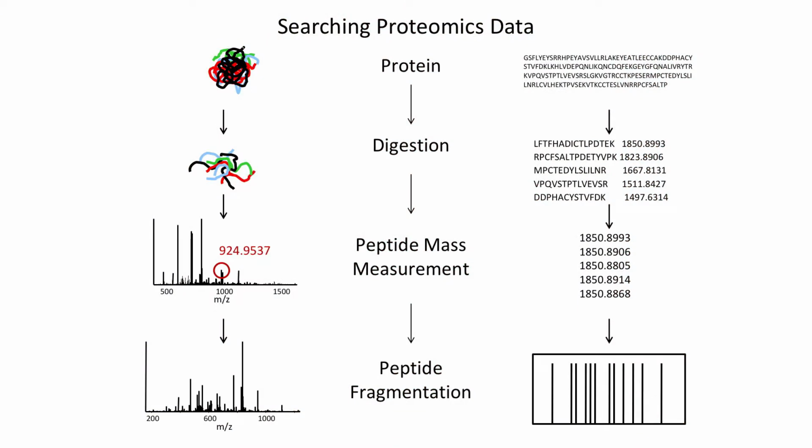You then look at the mass spectrum. You measure a peptide, this one right here. It's a doubly charged ion. So you pull out all the peptides that would fit with the mass accuracy of your mass spectrometer to this mass. Then you record the MS2 spectrum. You record the theoretical fragmentation spectrum of these, and then you use different algorithms and compare which one is more likely. And of course, you have certain assumptions in your algorithm, and if these assumptions aren't true, your identification could mean anything, and that in HLA peptides is often the case. So, and I hope I will show you throughout the talk what I mean by this.